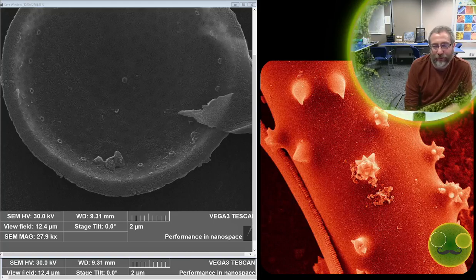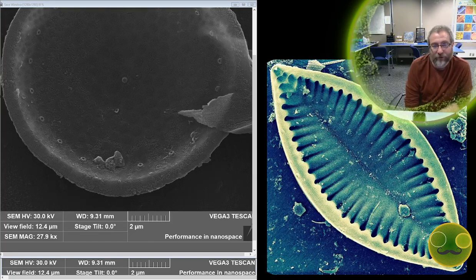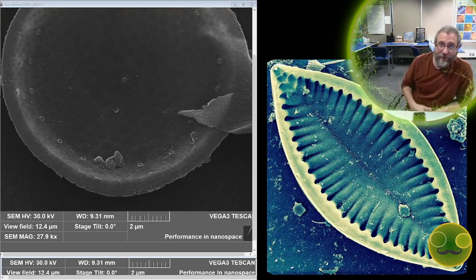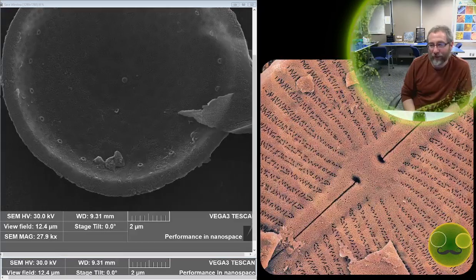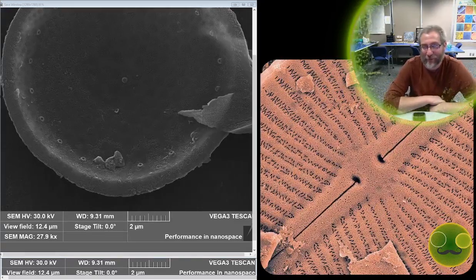If Andy, if you're out there watching this, we'll see what we can do about first processing it, and then trying a little bit of it completely unprocessed, and then sort of see. But I have to rinse the samples because they're cultured in salt water, because the Thalassiosira and organisms that we're looking at mostly prefer salt water. And if I just went ahead and put them on a stub or a slide, the salt crystals would actually crystallize out of the water as it evaporates.